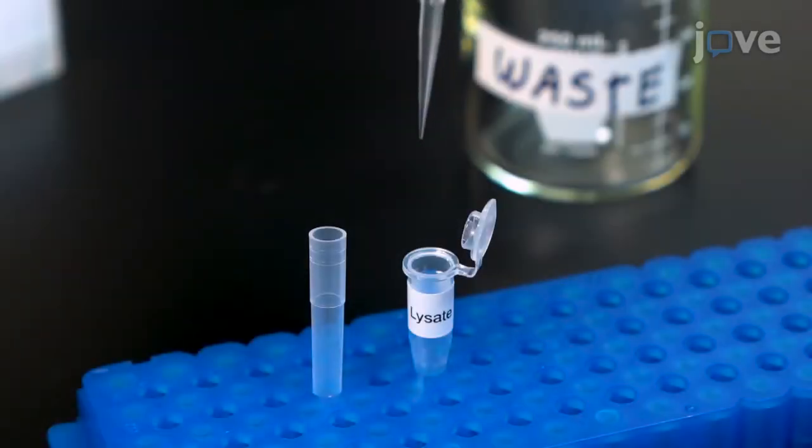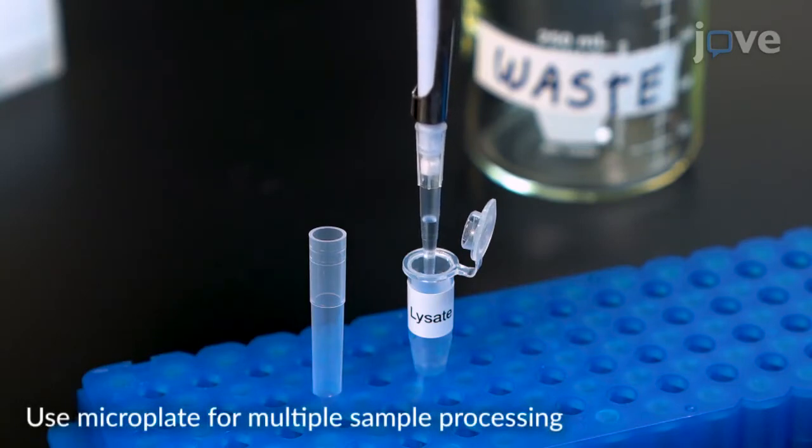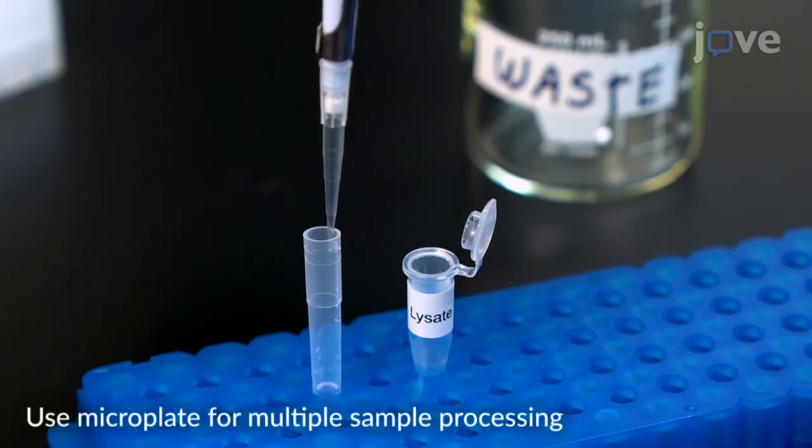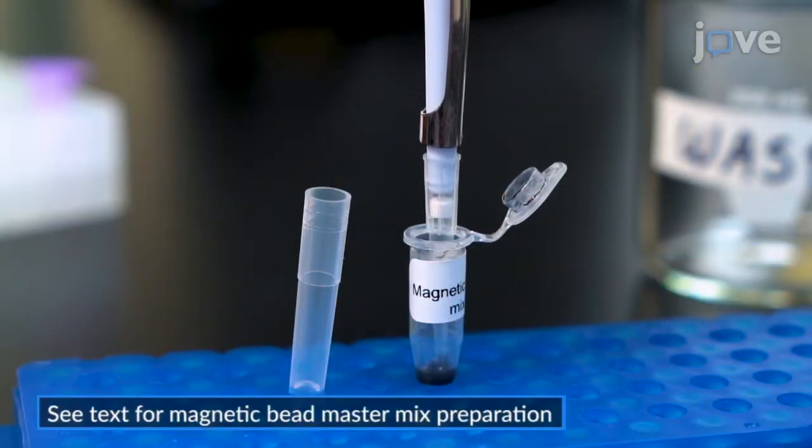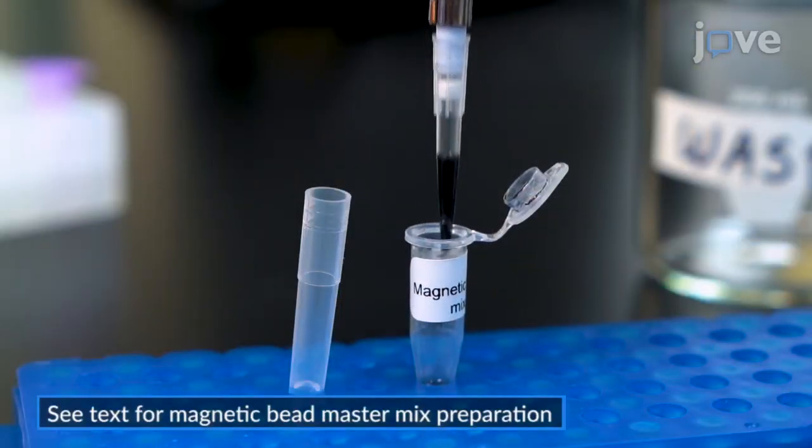To extract DNA, pipette 100 microliters of the tissue lysate into a new, clean microcentrifuge tube. Then add 215 microliters of the magnetic bead master mix.